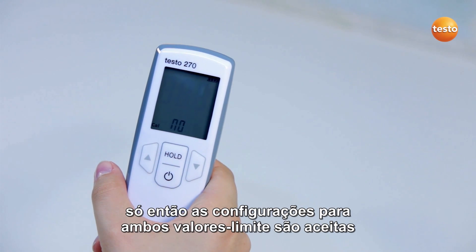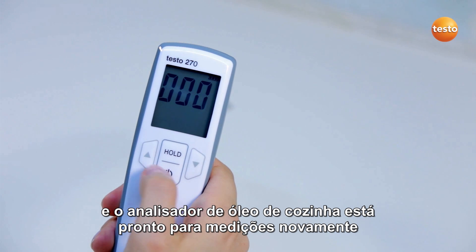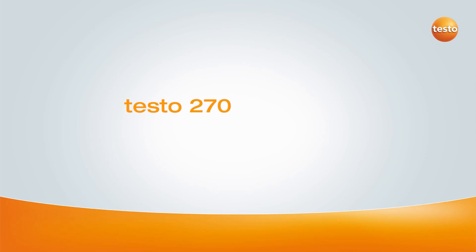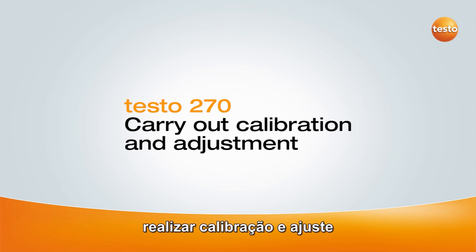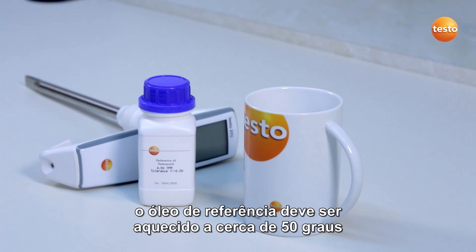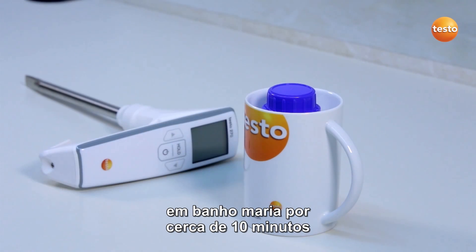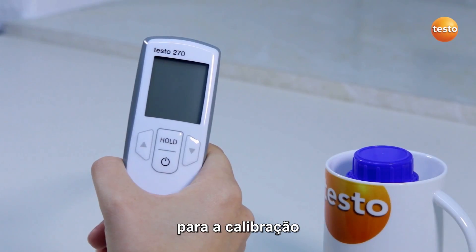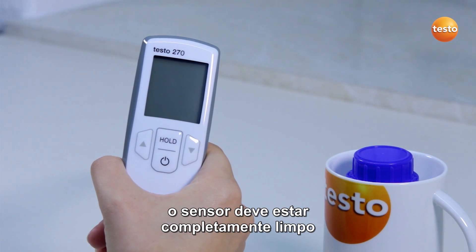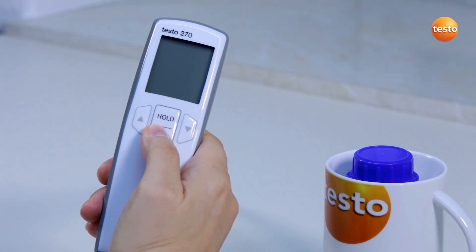Only then are the settings for both TPM limit values accepted. I exit the configuration menu with the on-off button, and the cooking oil tester is ready for measurement again. In order to carry out the calibration, the reference oil must be warmed to approximately 50 degrees Celsius. To do this, I immerse the reference oil bottle in a water bath for about 10 minutes. For the calibration, the sensor must be completely clean. I switch on the tester and call up the menu.